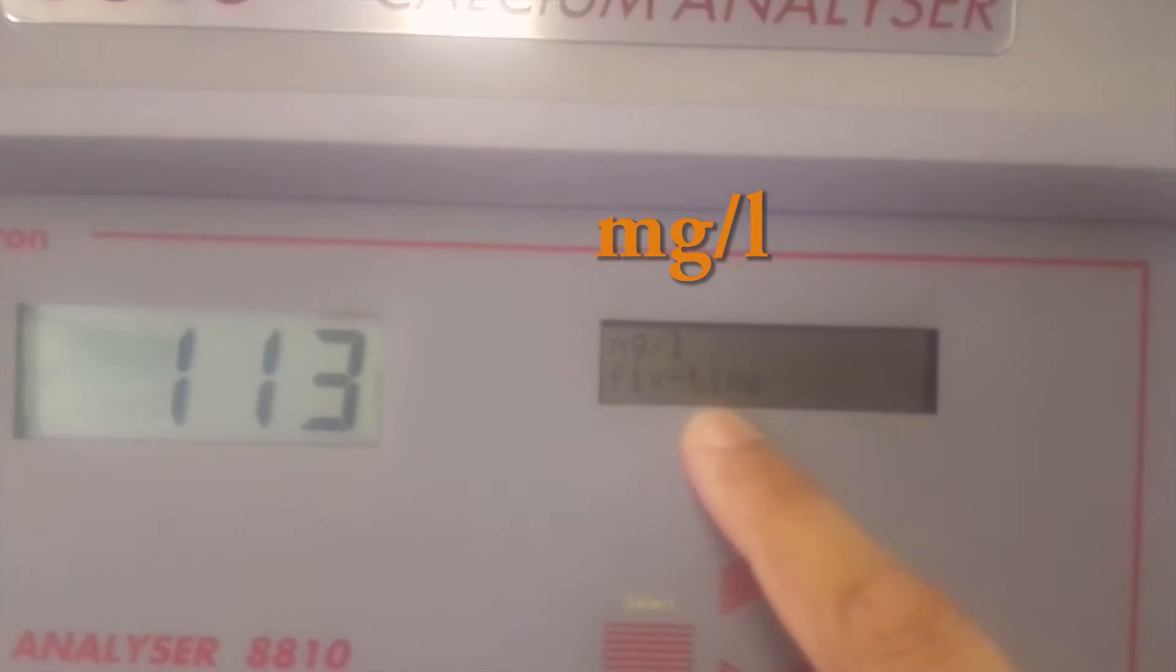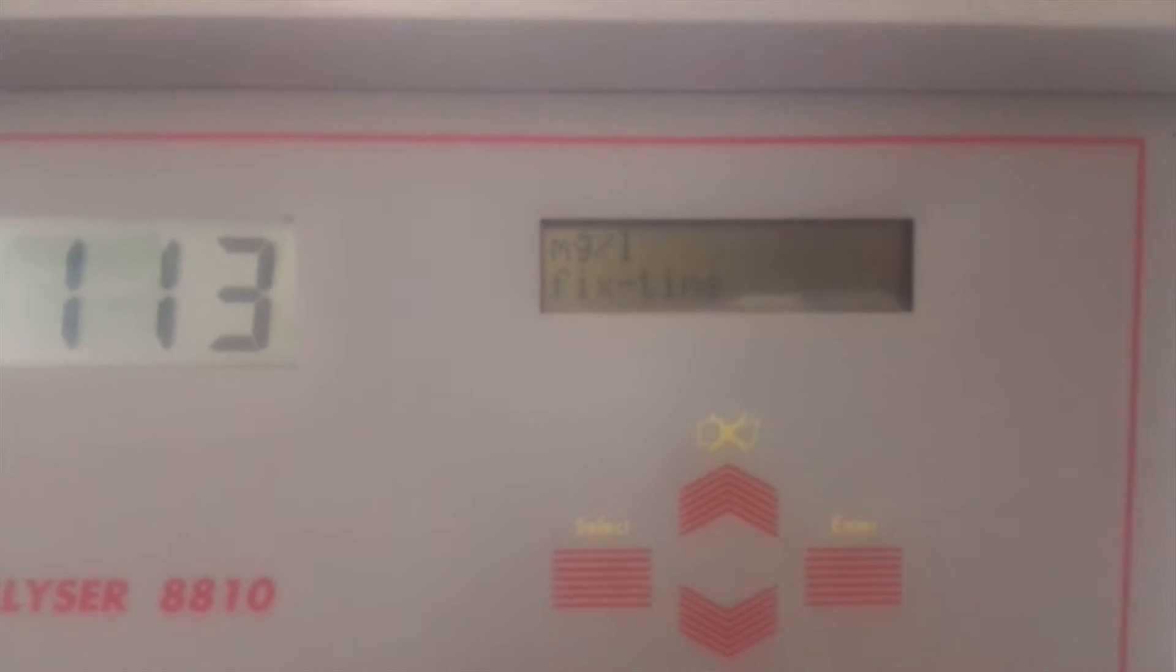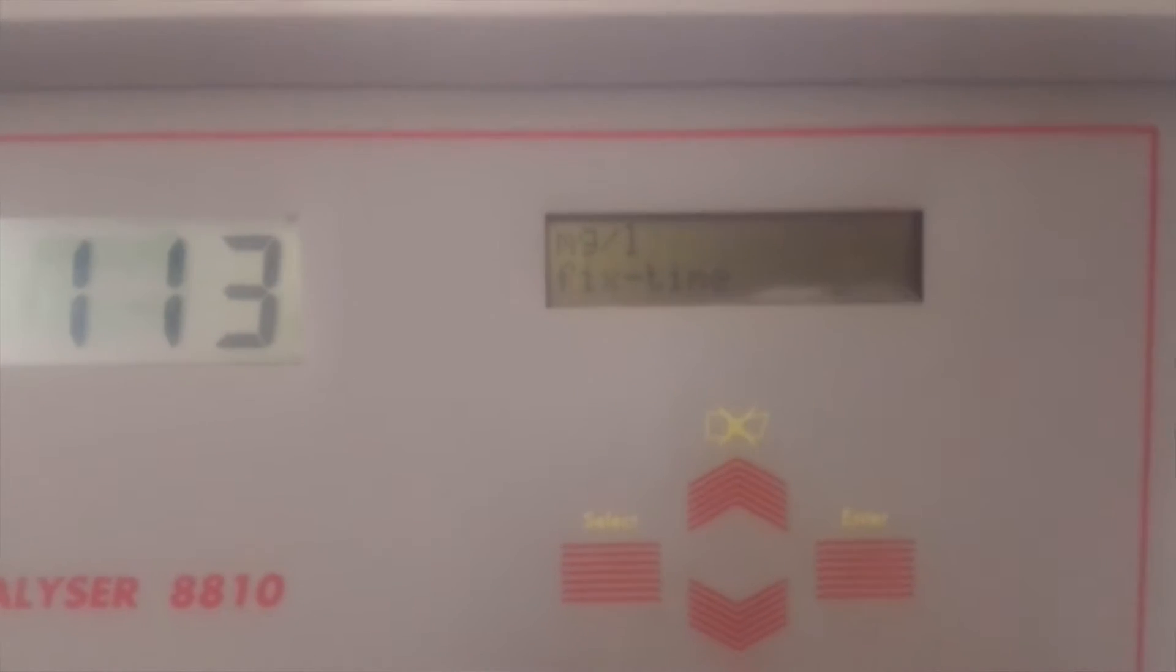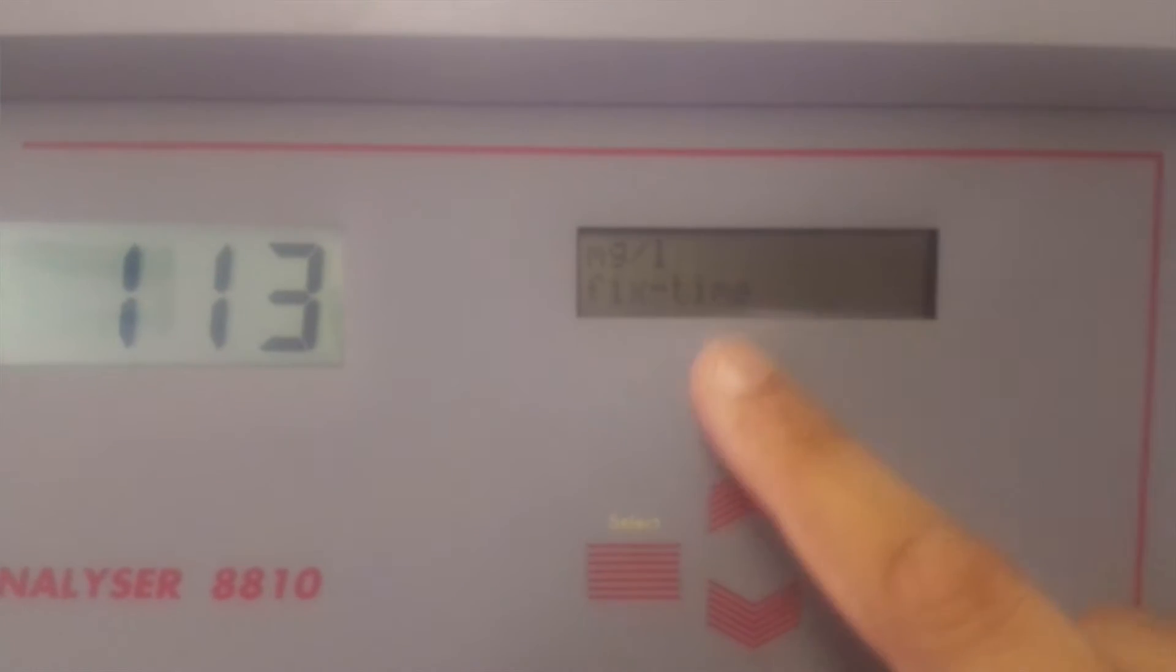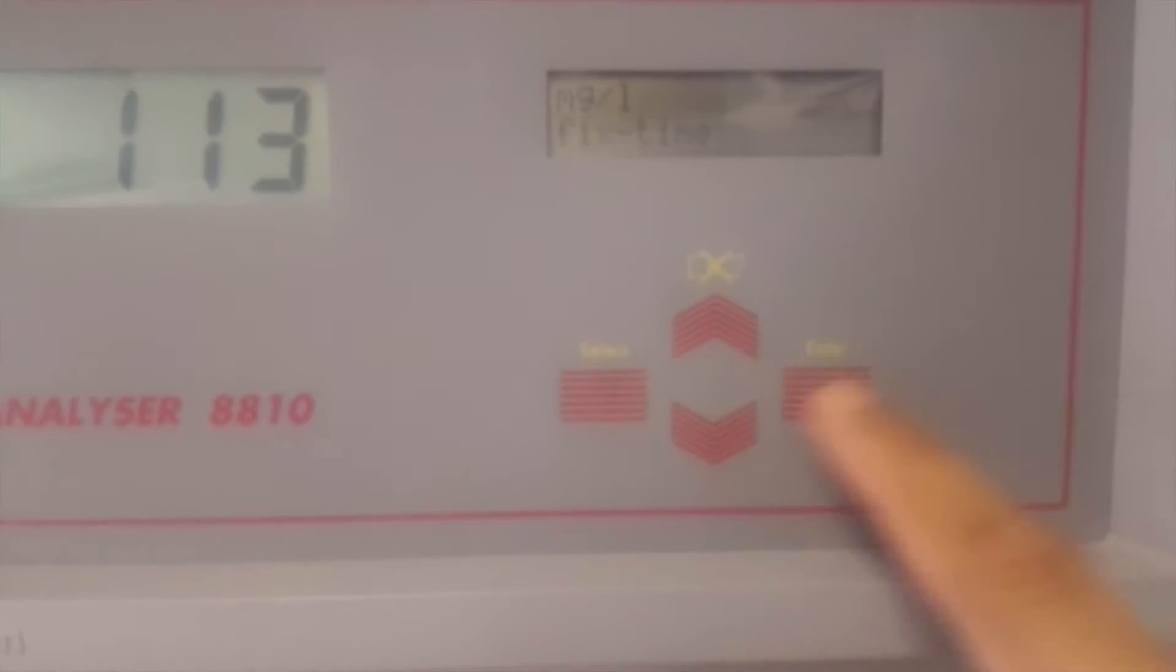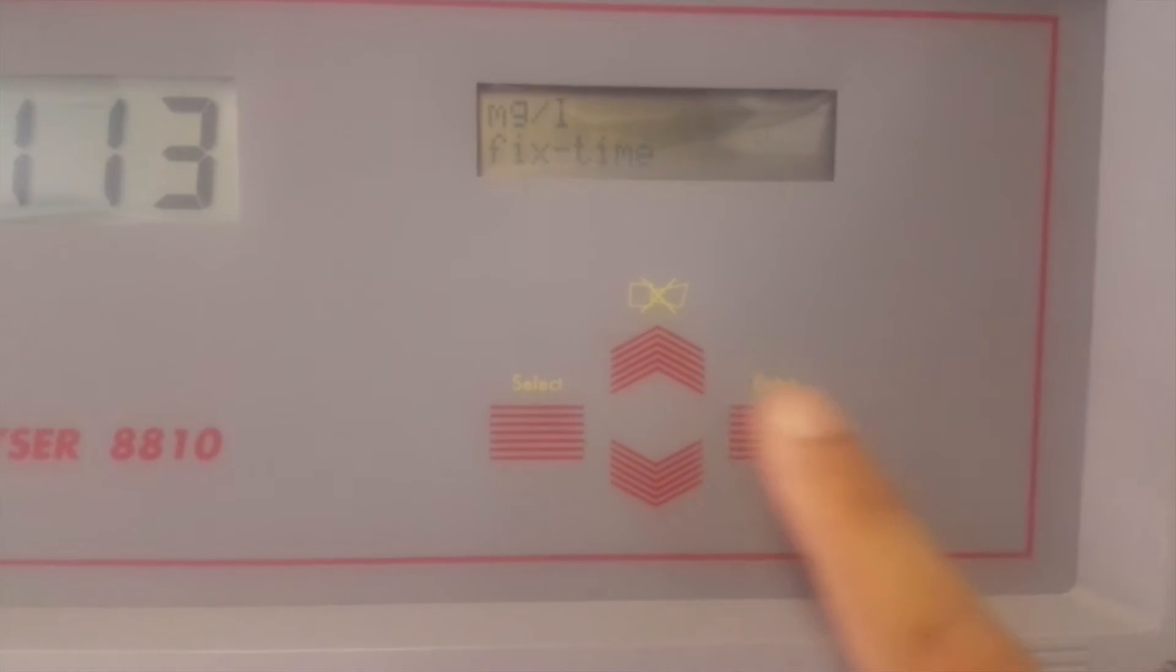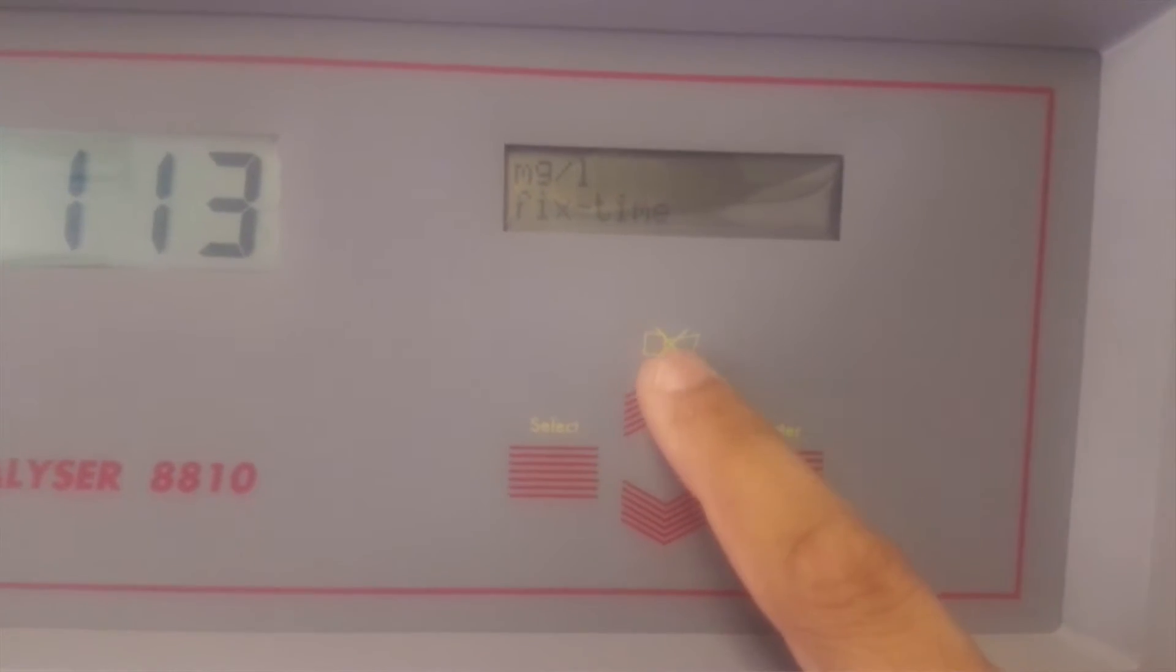Which is milligram, and the status of the analyzer or sequence mode. Now it is showing fixed time, which means it will give you titration results after a decided period of time. We set this time to 15 minutes. The display menu can be changed with these key buttons: select key, enter key, alarm acknowledge key, up key, and down key. You can use up and down keys to scroll through the menu.